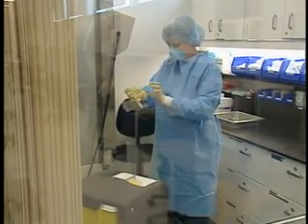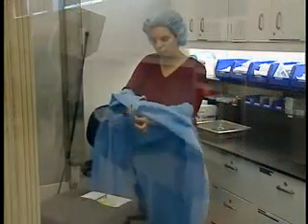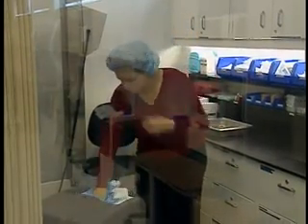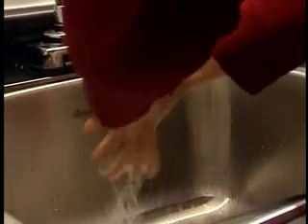Finally, you must never remove contaminated objects, clothing, or material from the room to avoid transporting antineoplastic particles outside the room. For this reason as well, you must wash your hands thoroughly after all handling is completed.